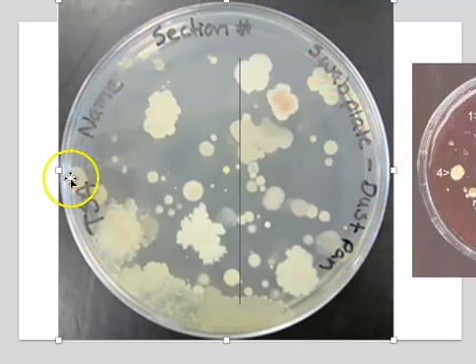You remember, you always want to put your name. You always want to write down what kind of media the agar is, what type of agar you've got in the dish. You also want to write down what's growing. And in an environmental sample, of course, you're not going to know what's growing until you evaluate it, but you can write down where it came from. So this was a swab plate that was created by sampling a dust pan. And the swab was then smeared over the surface of the agar to grow some colonies.